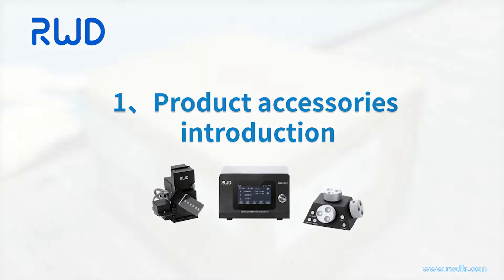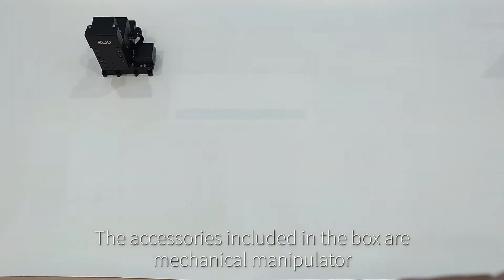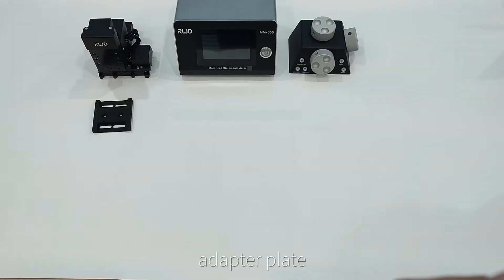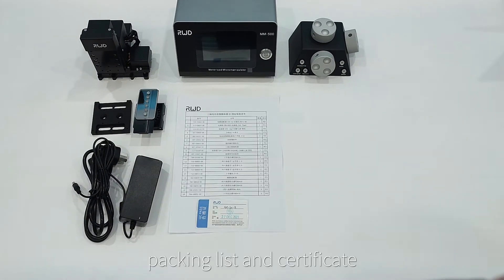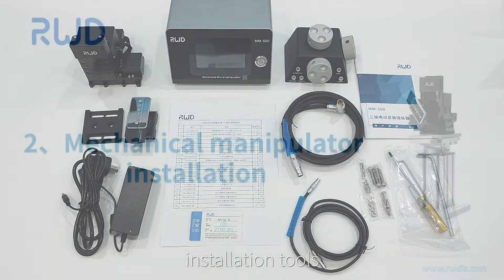Section 1: Product accessories introduction. Before unpacking, please check the outer packaging carefully. If there is any damage or bruises on the pack, please contact the vendor as soon as possible. The accessories included in the box are: mechanical manipulator, controller, rotary photoelectric encoder, adapter plate, dovetail base and slide rail, power wire, packing list and certificate, wiring, user manual, and installation tools.